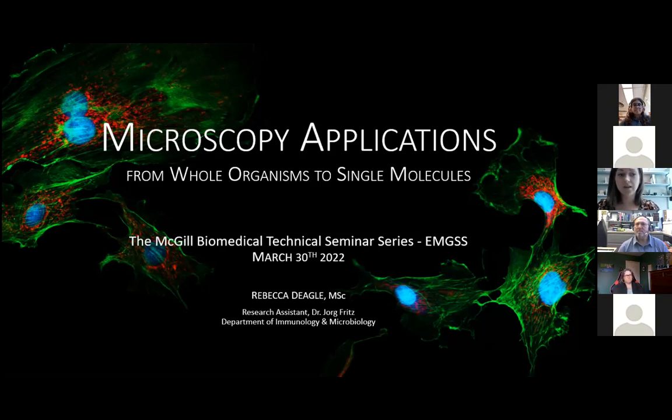So generally the way that these kinds of presentations work is you start with the most basic form of microscopy and you keep adding layers of complexity until you get to the most advanced types of microscopy, but that can be a bit difficult to translate into how to apply that technology to your sample. So I'm doing it in reverse this time, where I'm going to focus on general common types of samples that people use in research and the best type of microscopy application for that particular sample and what you want to find. So we're going to start with whole organisms, the largest kind you can use, and we're going to zoom in, pardon the pun, to organs, tissues, single cells, and single molecules.